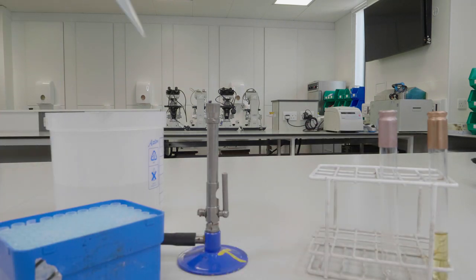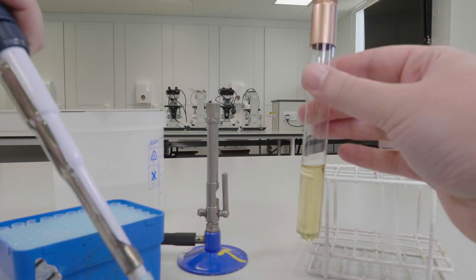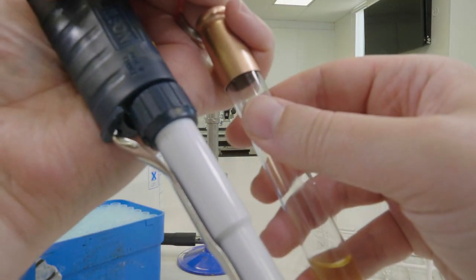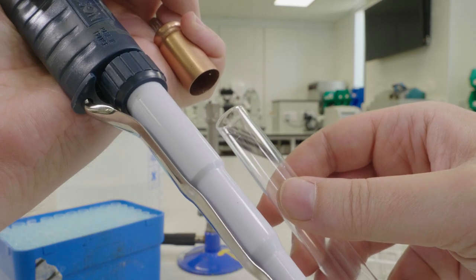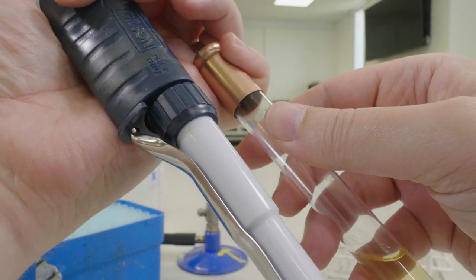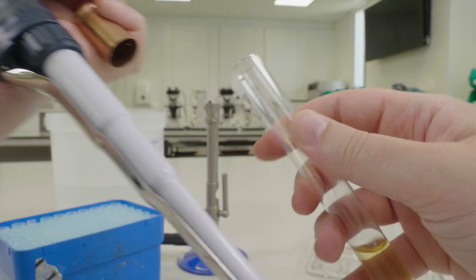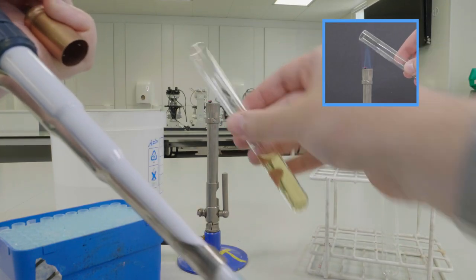Then take the tube you want to remove liquid from and remove the lid using the little finger of your dominant hand. You can then pass the open end of the tube through the hottest part of the Bunsen flame to kill any lingering organisms.